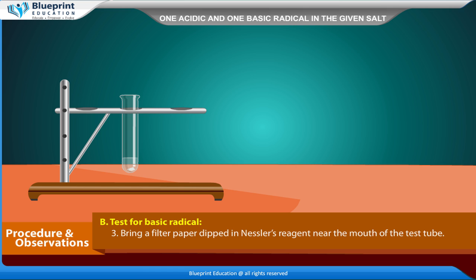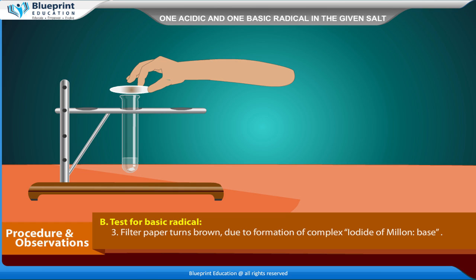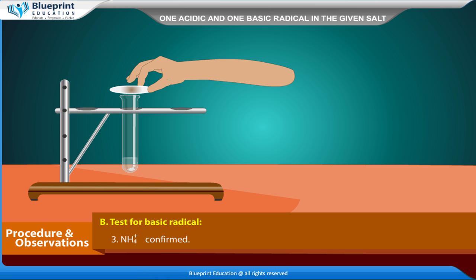Bring a filter paper dipped in Nessler's reagent near the mouth of the test tube. The filter paper turns brown due to formation of complex iodide of Millon's base. NH₄⁺ confirmed.